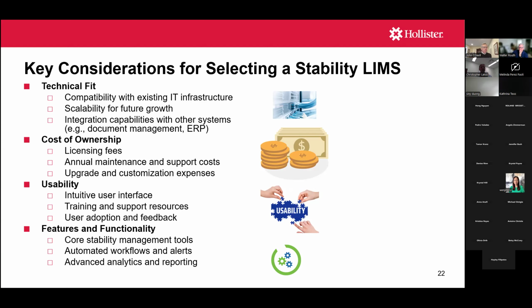In some cases, some stability LIMS systems have the capability. Typically, they have to do some type of interface, so some type of customization, but you have the capability of interfacing with other systems.